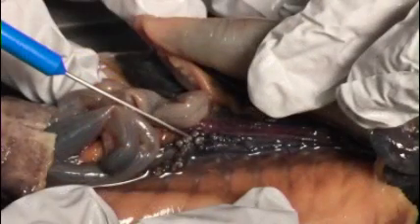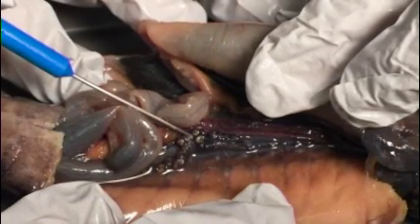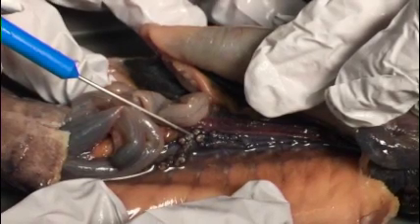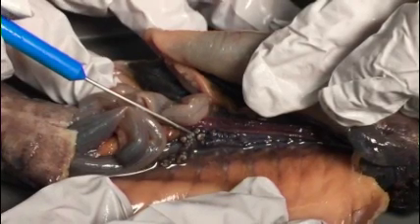If you guessed they were kidneys, then you guessed it right. The more slender anterior parts of the kidney are genital in function, since the tubules in the region of the kidneys are modified for sperm passage. The broader posterior parts are urinary in function.